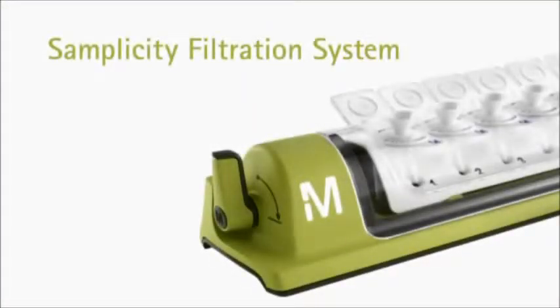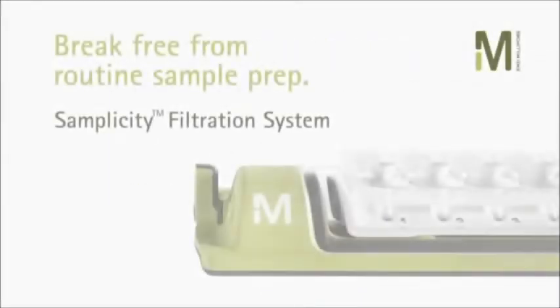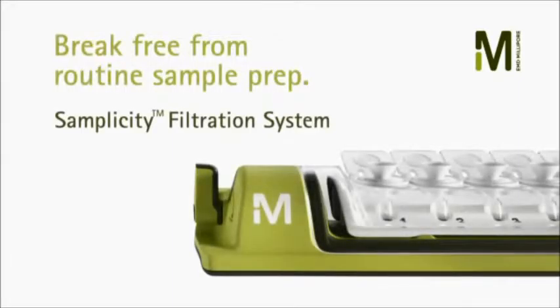The biggest advantages of the Simplicity system over traditional manual filtration processes are speed, ease of use, and comfort. It's time your sample prep kept pace with your separation speeds. That's why we developed the Simplicity Filtration System.